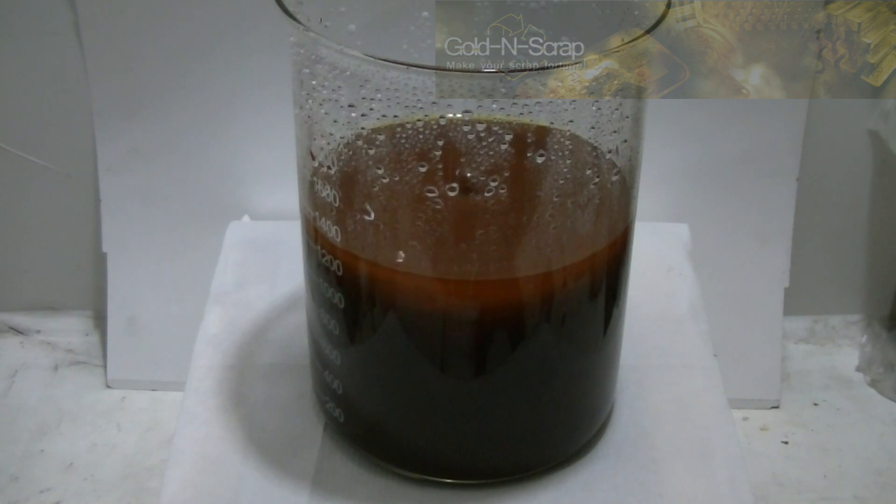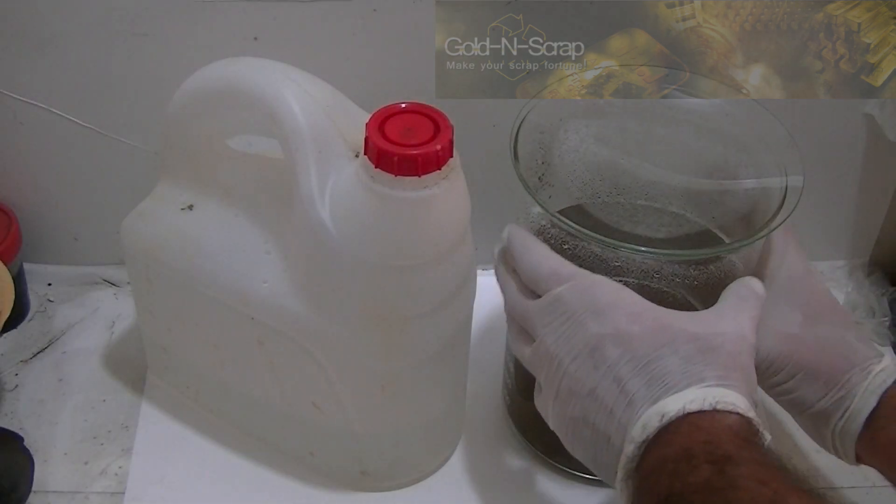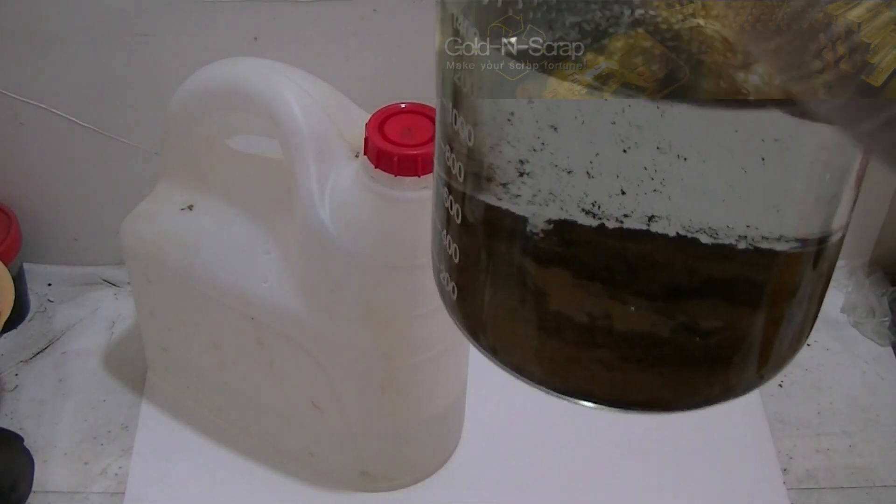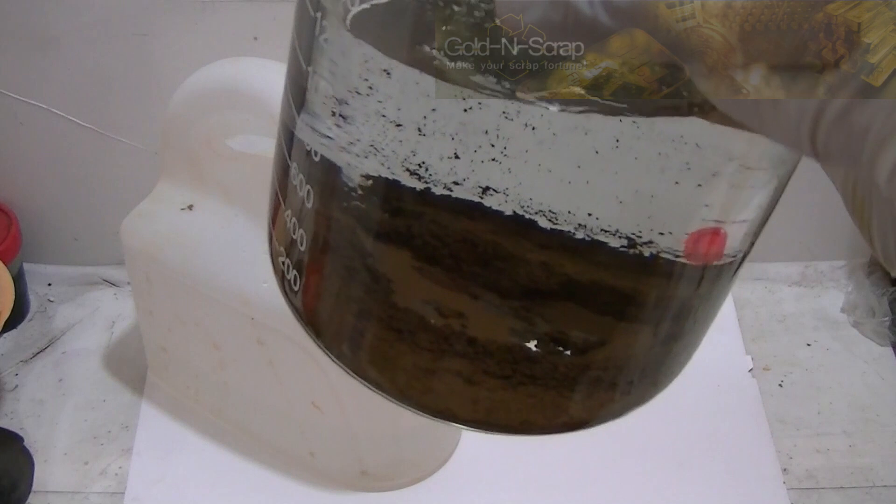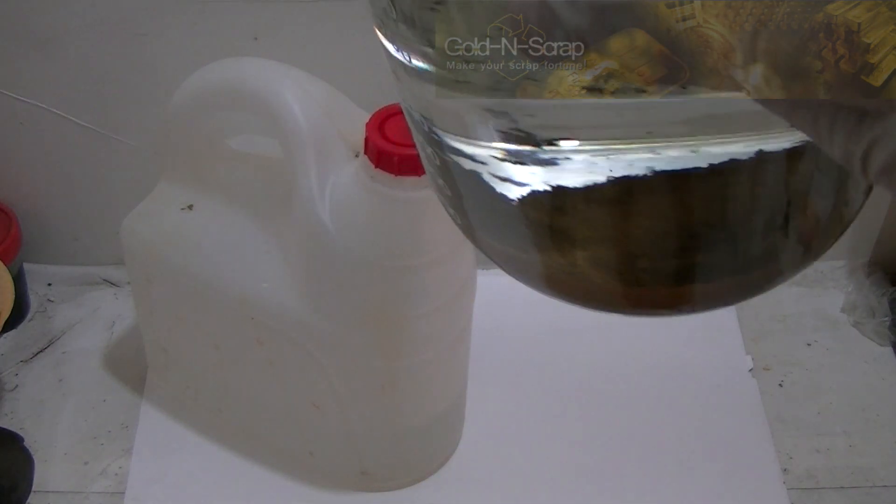The solution is again left to settle overnight. Here you can see the gold powder all settled to the bottom of the flask and the supernatant is practically colorless. This is a good indication for purity.